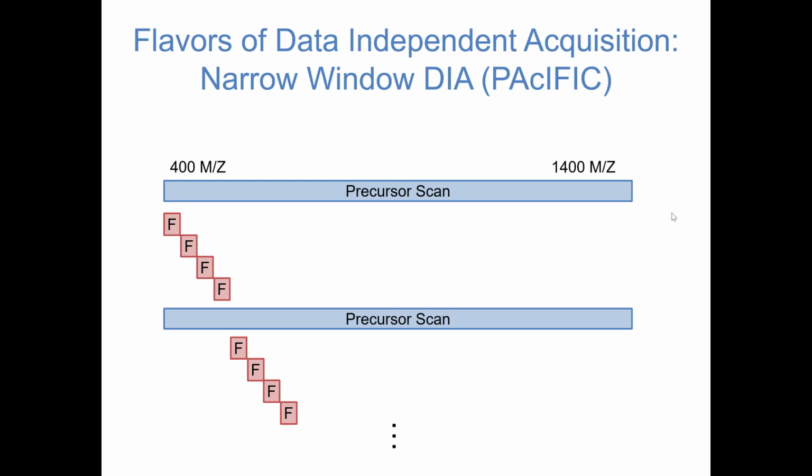Yeah. So for example, an orbitrap or an ion trap can only hold about 1 million ions in it at one time. And if you've got a really complex dynamic range, such as the serum samples that Rudy Ebersold was talking about, where 99% of your protein comes from 8 different proteins, then the instrument collects most of its signal on just one peptide that's eluting at that same time point. You might have a handful, 10 ions out of your 1 million ions, that are actually for any other analyte associated with any other possible peptide.